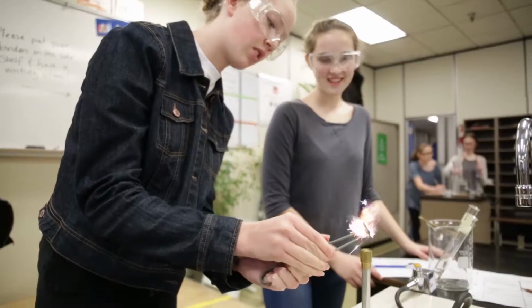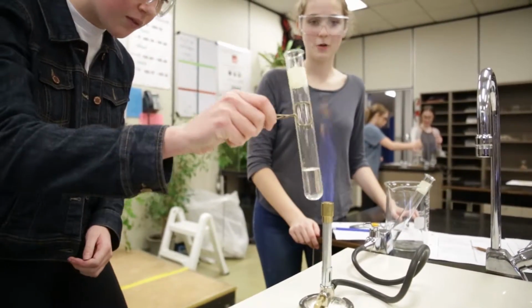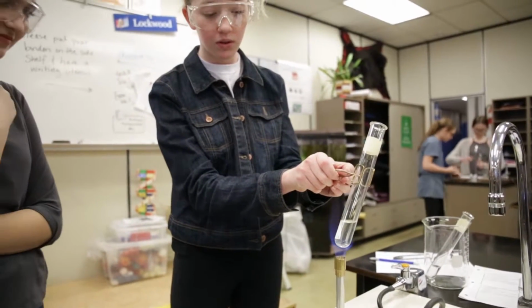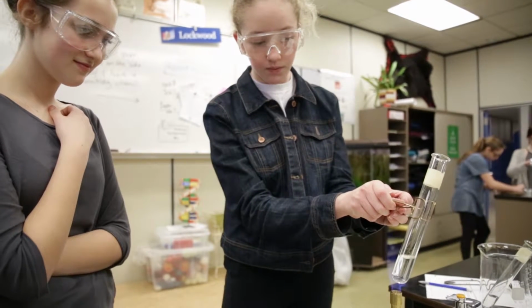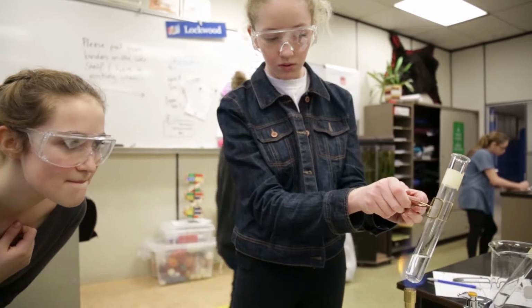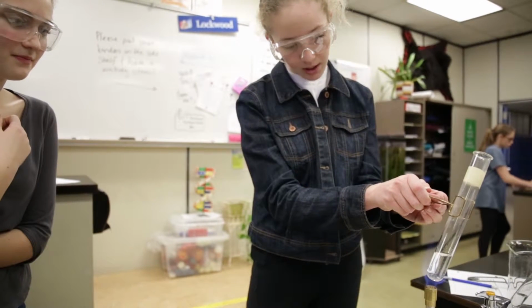There we go. We got it. Alright, ready? Hottest part of the flame. Get away from yourself. I know, it's hard. Point it that way. I'm trying not to touch the flame. Oh yeah, some bubbles are starting to come out.